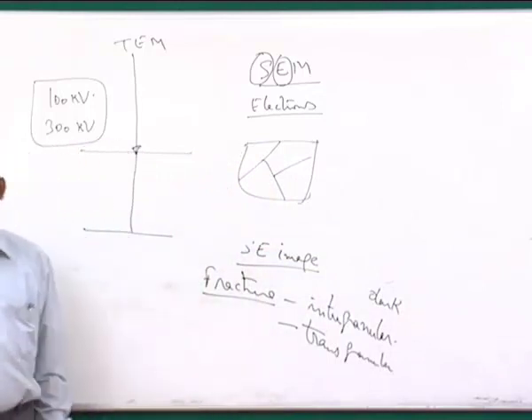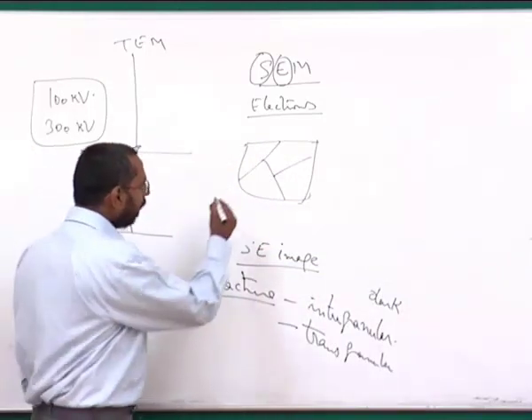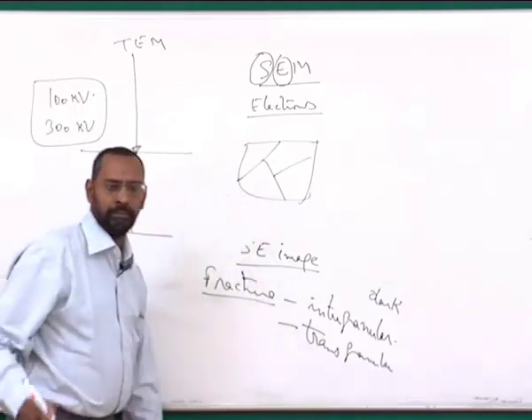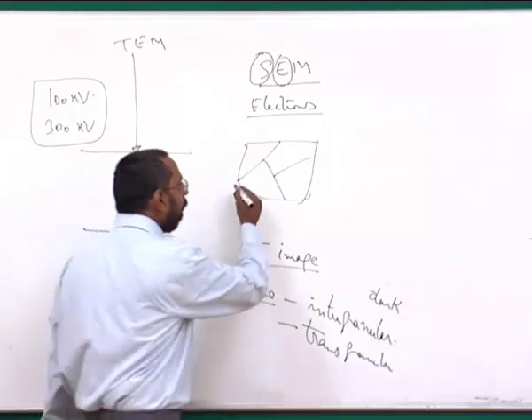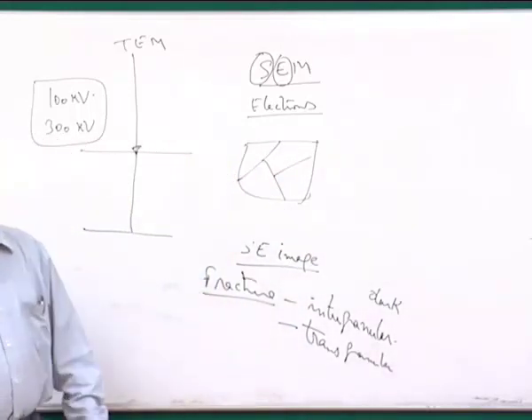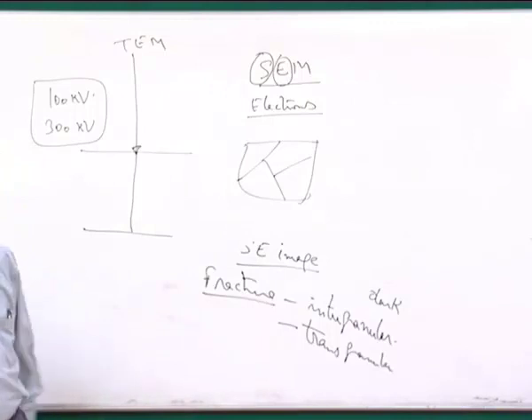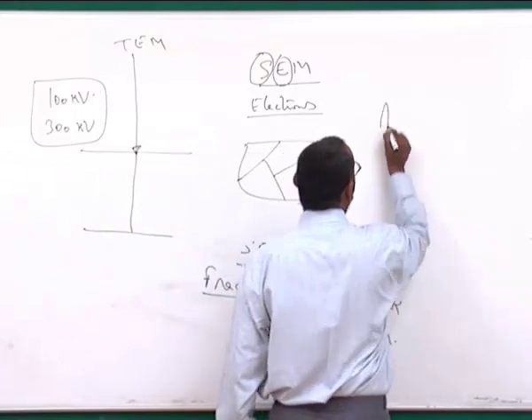If this is a grain structure of your sample, by any chance, if the grain boundary is very brittle, it could be because of a brittle compound present at the grain boundary. There are different types of microstructures where we see this kind of situation. For example, I can give you at least two examples. One is an aluminum copper alloy.